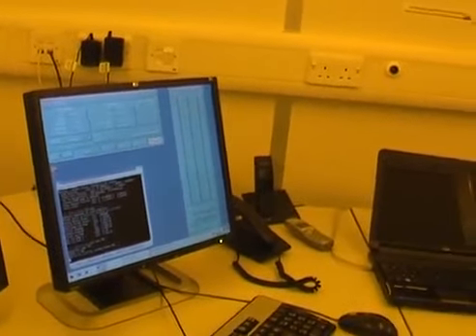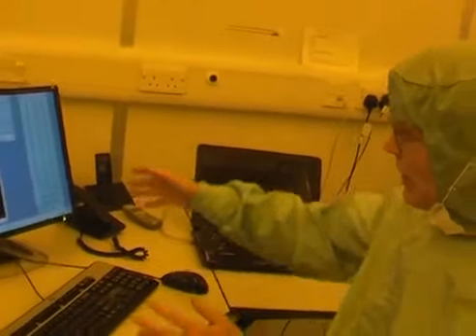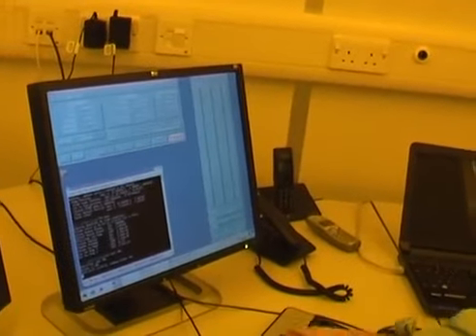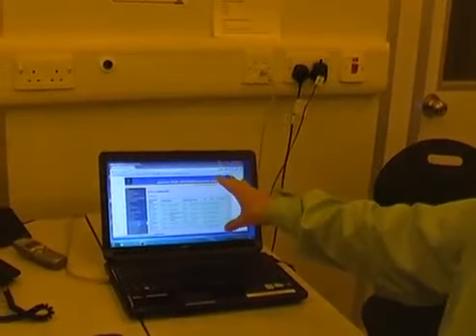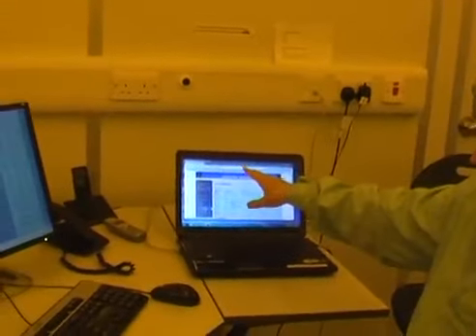So okay, let's look at various things we have in this room. This is the monitor and keyboard for the Linux workstation, which runs the whole VB6. Here is just a laptop PC, which is very useful because that means I can have a website running on here, an extra screen effectively.